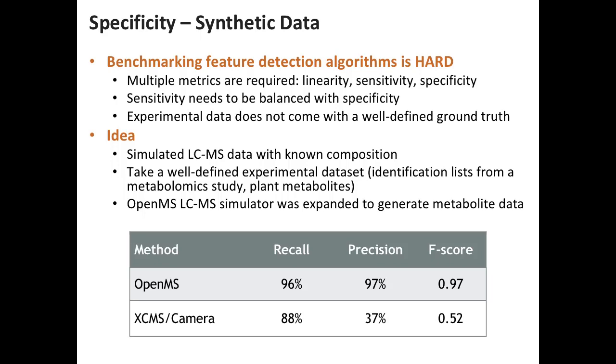simulate the spectra. We can put noise on that. The simulator has different noise models. And the good thing is you have now a ground truth. There's nothing in there except noise that doesn't have a feature behind it. And then you can start doing a more thorough statistical analysis and start asking questions about what is the precision, what is the recall of these methods. So do we actually hallucinate features?